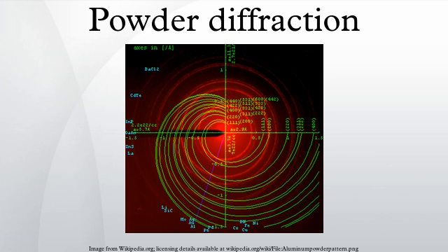Neutron diffraction techniques may therefore be used to detect light elements such as oxygen or hydrogen in combination with heavy atoms. The neutron diffraction technique therefore has obvious applications to problems such as determining oxygen displacements in materials like high-temperature superconductors and ferroelectrics, or to hydrogen bonding in biological systems.